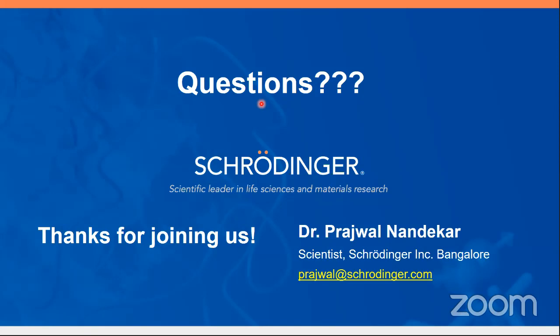So the next question is, can we open molecules drawn using other software like ChemSketch in Schrodinger? Yes, if it is saved in a format like Mol2 or SDF or SMILES or CDX, so it depends on the format. If it is saved in such formats which are recognized in molecular modeling, then yes, definitely you can open it in Maestro.